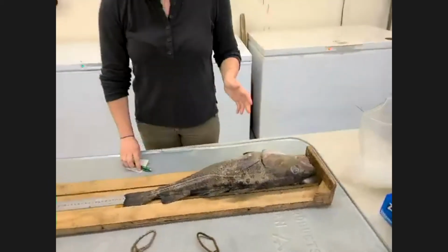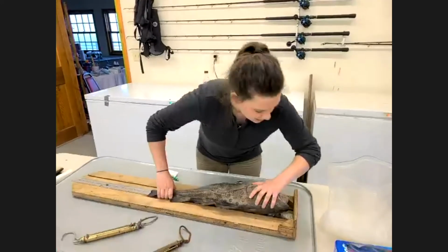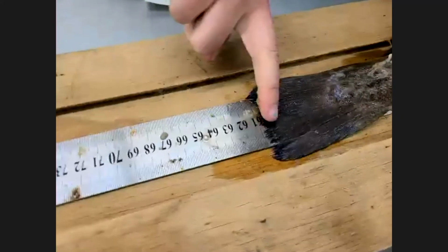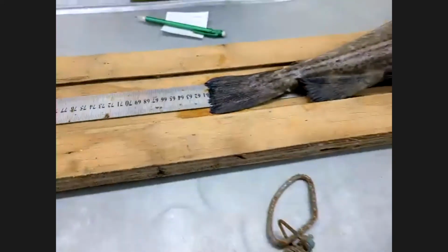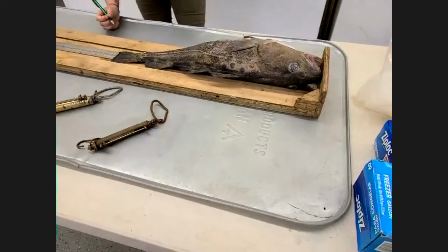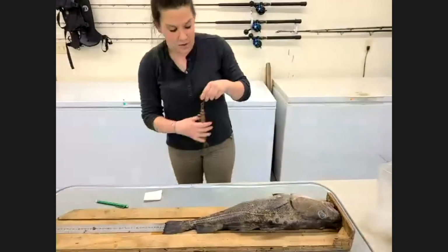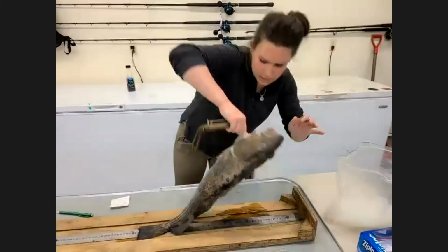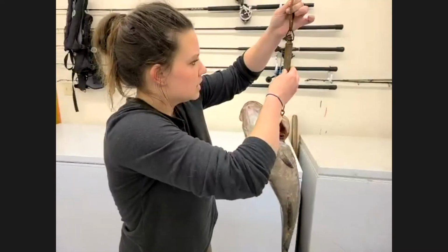So the first thing that we need to do, just with the Sentinel survey in general, is take a length and weight. So I'm going to put the nose all the way to the edge. See right here. I'm going to call that 61, even though it's a little bit less than 61. Essentially, if it's over the 60 line, we round up. So 61 centimeters. I'm writing all of this down. The organization key: we want to make sure that we can keep all of these samples straight with the fish that it comes from. This guy here was just about 6 pounds.